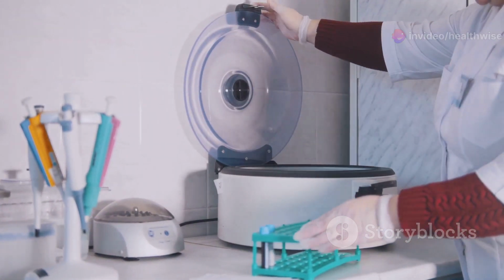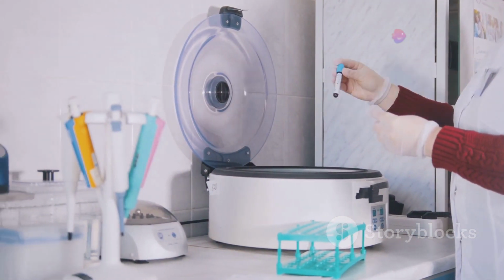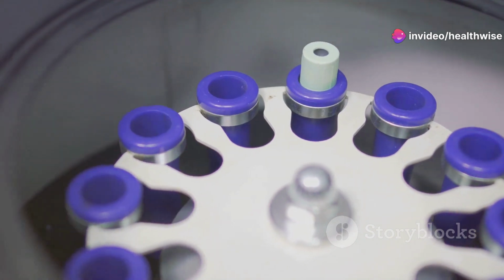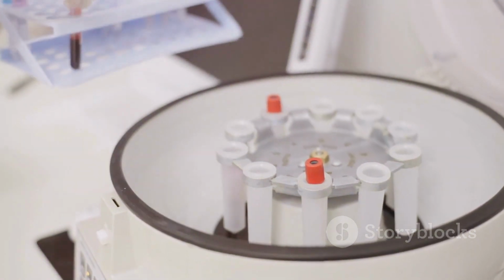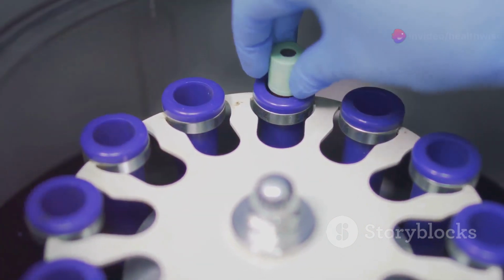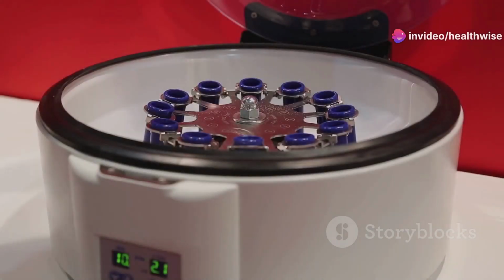Centrifuges are essential tools in a vast array of scientific and medical fields. From analyzing blood samples to isolating DNA, these machines play a crucial role in research, diagnostics, and even the production of life-saving medicines. Without centrifuges, our understanding of the microscopic world would be far less clear. So buckle up as we explore the fascinating world of centrifuges and discover how these spinning wonders are helping us unlock the secrets of the universe.